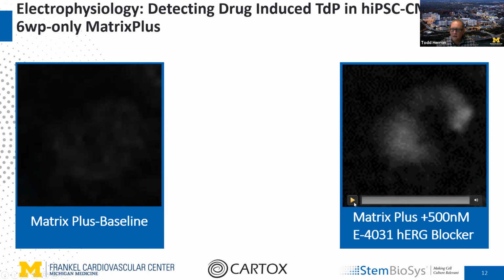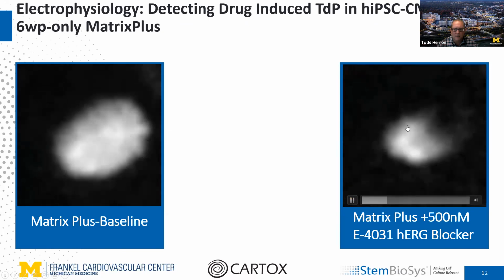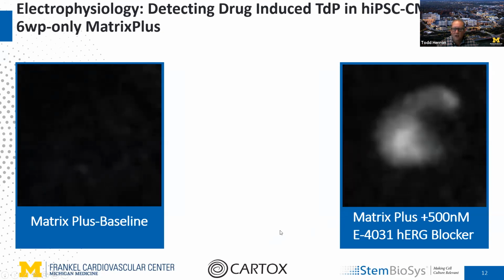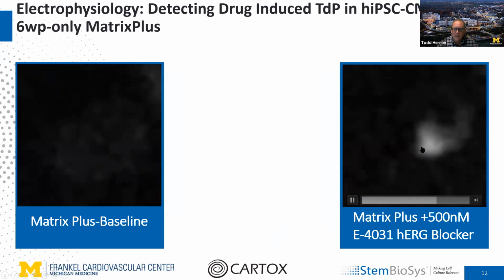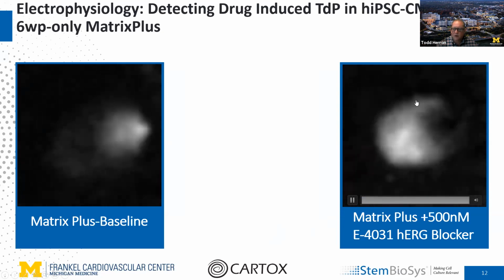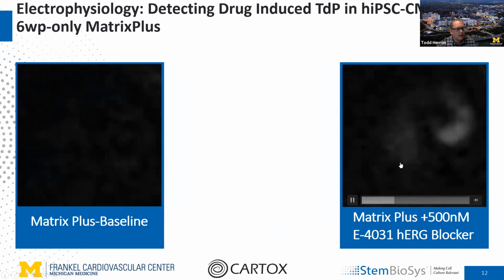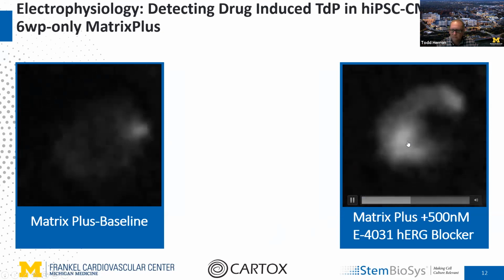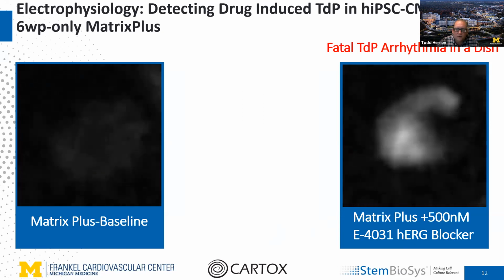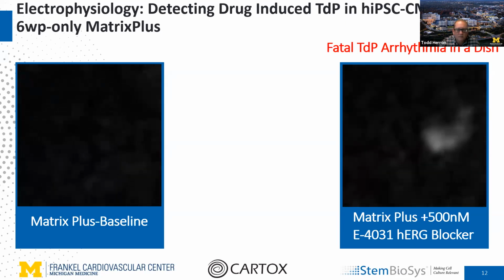And you can see very nice propagation of the wave uniformly throughout the monolayer as the wave spreads from left to right. When we add to the same monolayer a hERG channel blocker, a compound or drug that causes arrhythmias by prolonging the action potential duration, we saw a much different activation pattern, where the activation pattern became a very stable rotor, a spiral wave that is reminiscent of the reentrant activation pattern that would occur during fibrillation of the heart. This is exciting because it shows that we can record and observe fatal torsade de pointes-like arrhythmias in vitro, where it's induced by a medication.